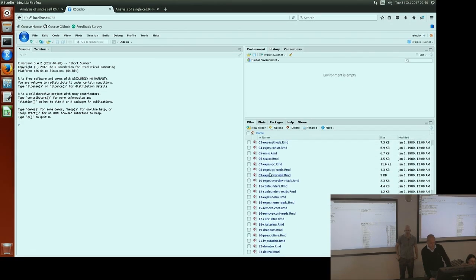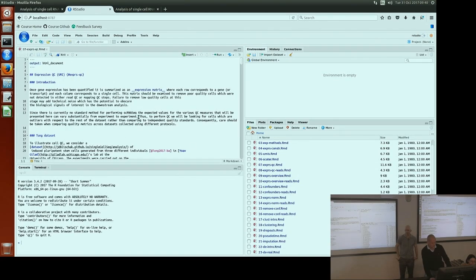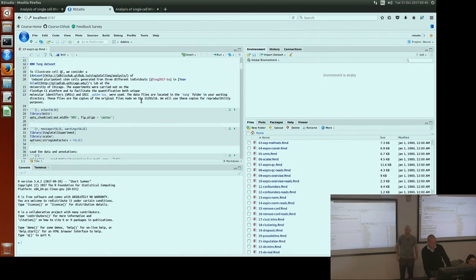You can basically run everything you see on the website from here, and also plot the images. So if you don't want to install a lot of packages at home, you can just install Docker and run it from Docker.